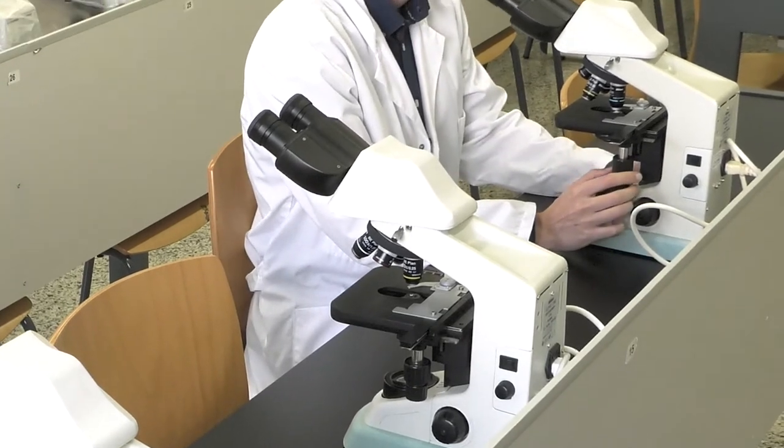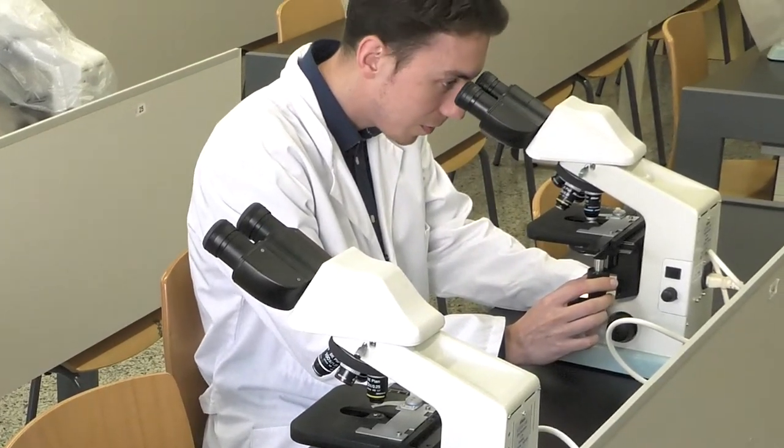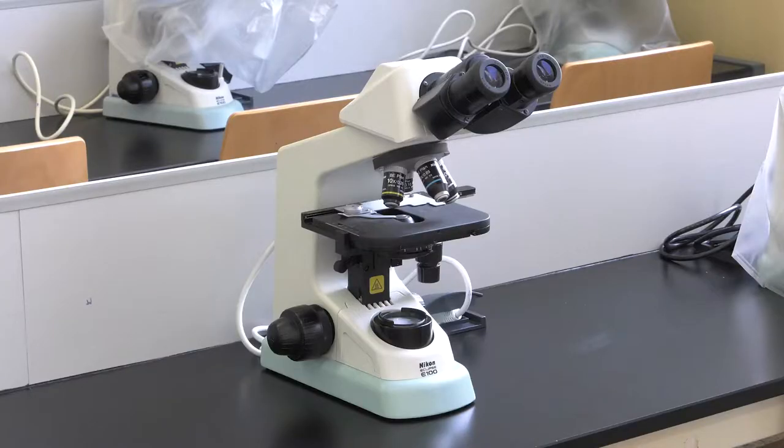The optical microscope is an instrument that allows us to see objects that are too small to be seen by the naked eye.